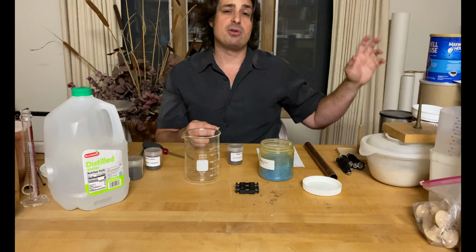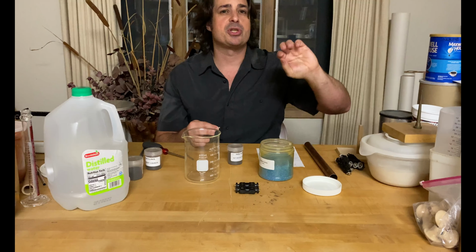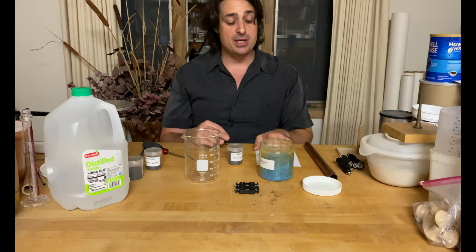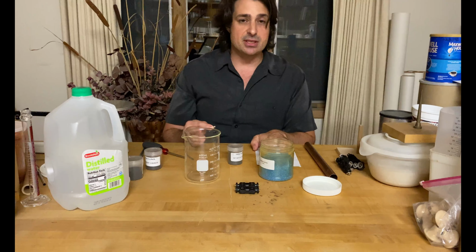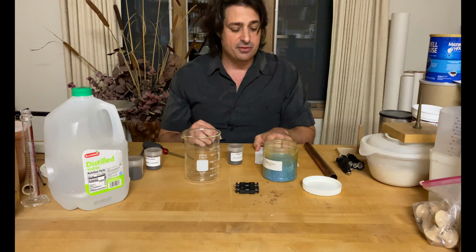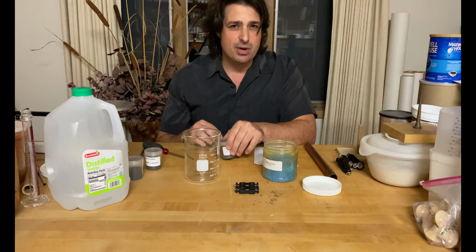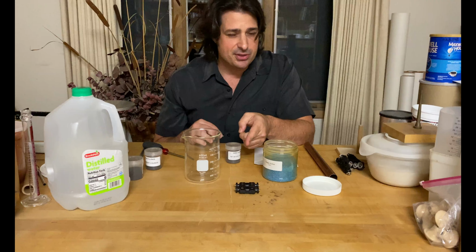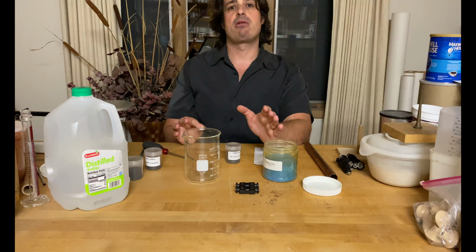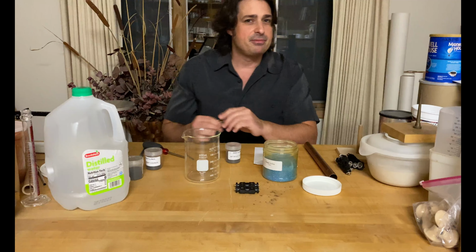And you have to go to the periodic table of atoms to figure out what weight is going to proportionally change the measurements as you weigh out the materials. So for this experiment, it'll be 159.6086 grams of copper sulfate, that is blue vitriol, combined with 55.845 grams of iron filings. Let's go ahead and get started. And again, in the presence of a magnetic field, what will it do? Maybe we'll have a new way to forge metals out of liquids without any heat, or maybe it'll just make a mess. Let's find out.